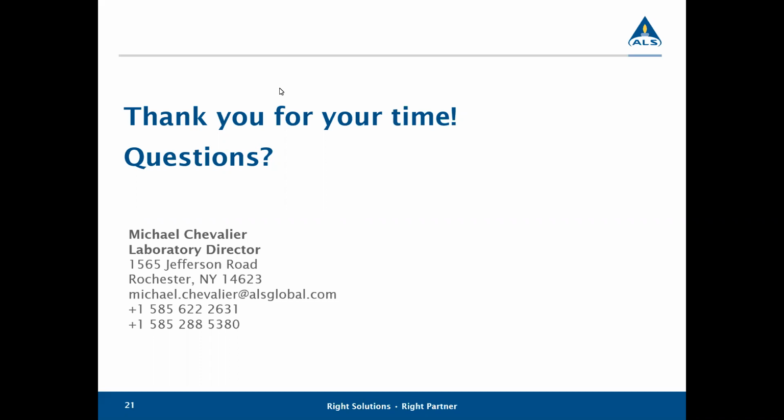Matt is asking for longer term deployments. For example, could freezing of groundwater in the well over winter potentially cause any issues such as damage to the samplers? No, this is not something that we've had an issue with in the past. Our field team actually uses these for certain applications. We're up here in Rochester, New York, which, you know, we see our fair share of winter, and nope, haven't had an issue with that.